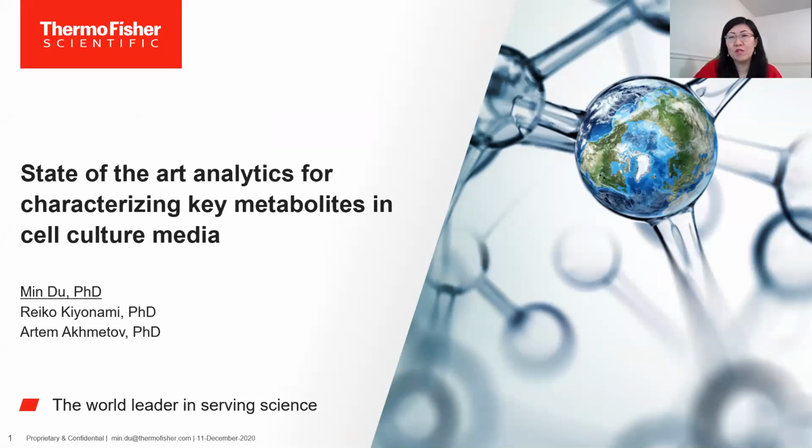Hi, everyone. Good afternoon. My name is Mindu, and I am the Biopharma Application Team Manager here at Thermo Fisher Scientific, Chromatography and Mass Spectrometry Division. Like Alicia said, today I will discuss with you how to use the state-of-the-art LCMS techniques to profile the key metabolites for cell culture media analysis, which is very important for biopharmaceutical development.